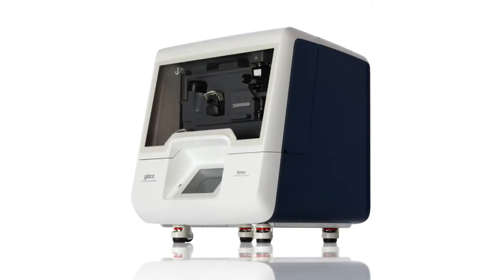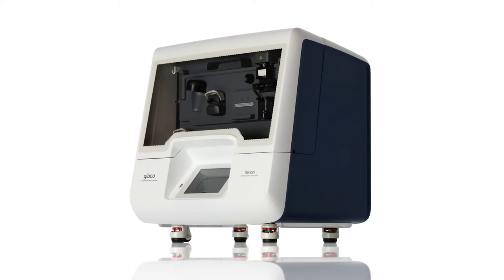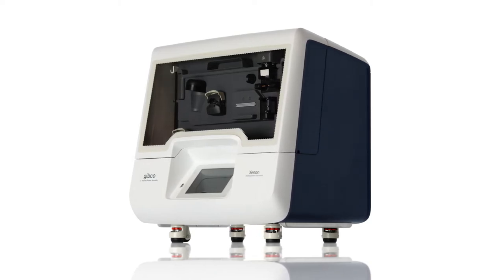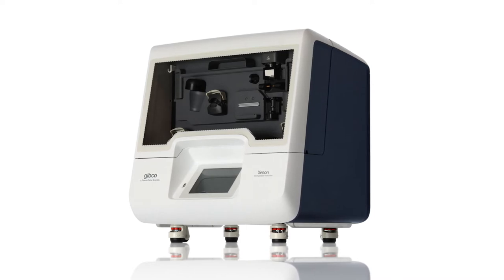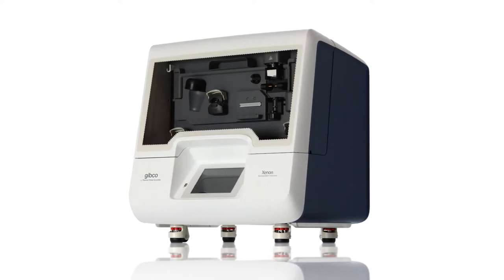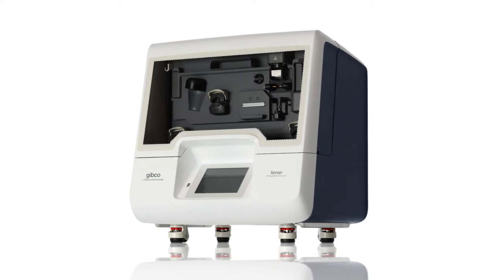The Gibco Xenon electroporation instrument efficiently delivers DNA, RNA, or protein into a variety of cell types, including primary and stem cells, with a high cell survival rate. Protocols are optimized for ease of use and simplicity, and conditions can be optimized for your payload and cell type.